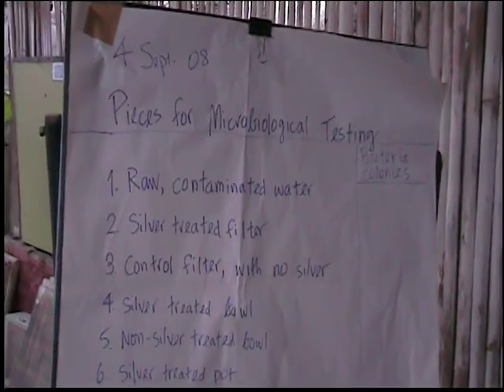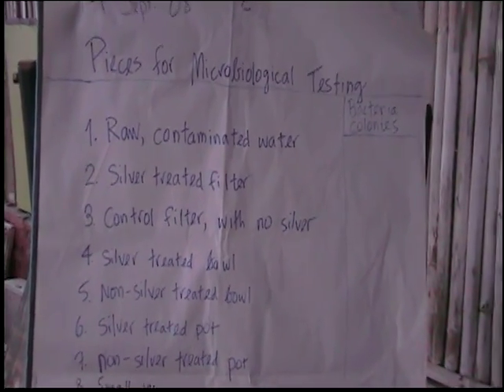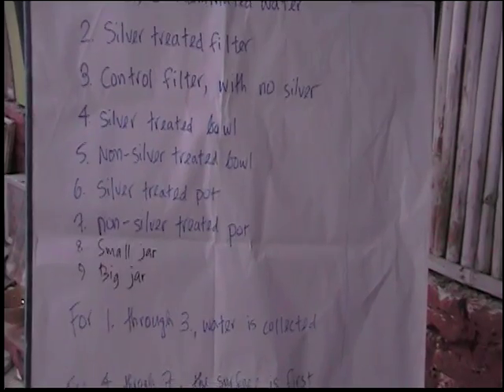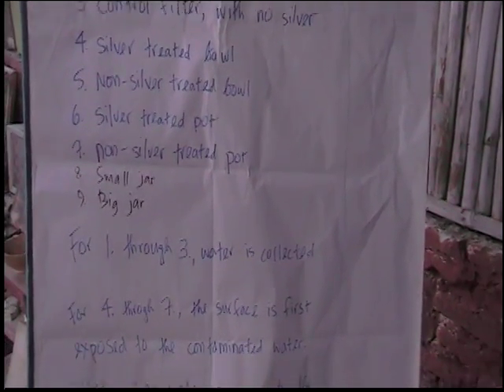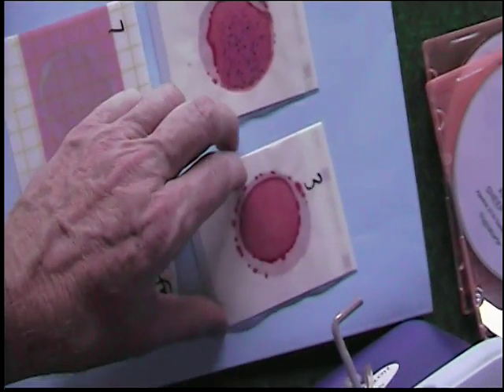These are the numbers and the pieces for the E. coli testing. Numbers 1, 3, 5, and 7 were non-silver, and these are the ones — 1, 3, 5, and 7 — which indicated E. coli. That's the raw water.